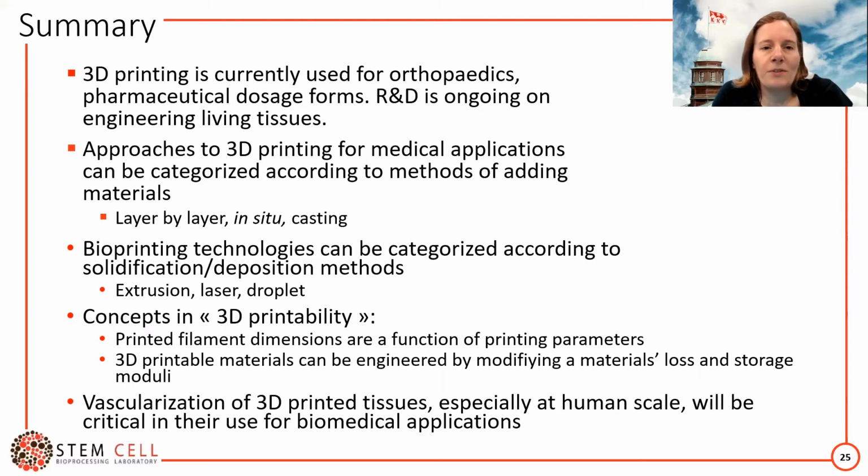We spoke about some approaches, categories of ways to generate living tissues, layer by layer, in situ casting. We also talked about the 3D printing equipment type categories of how you can deposit living cells on a 3D printed construct, so by extrusion, laser or droplet technologies.